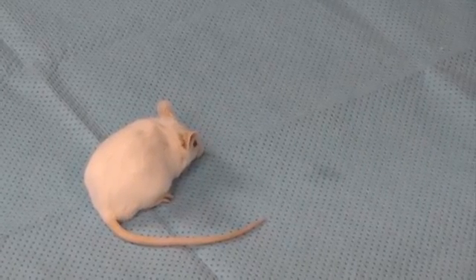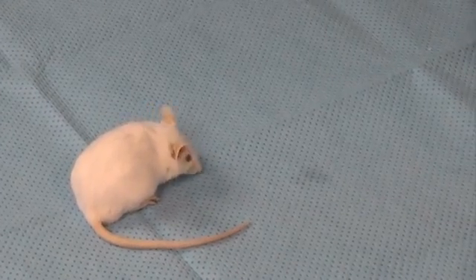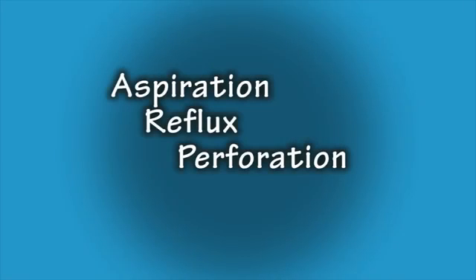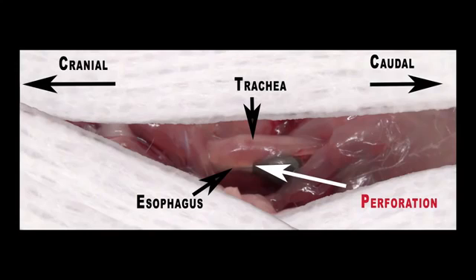Complications from any gavaging procedure include the chance of aspiration, reflux, or perforation of the stomach or esophagus. To minimize aspiration complications, a technician gavaging for the first time should practice with a small amount of saline, because even if aspirated, a small amount of saline can be absorbed by the lungs. Here you can see perforation from a metal tube — this perforation is much less likely to occur with a plastic feeding tube.